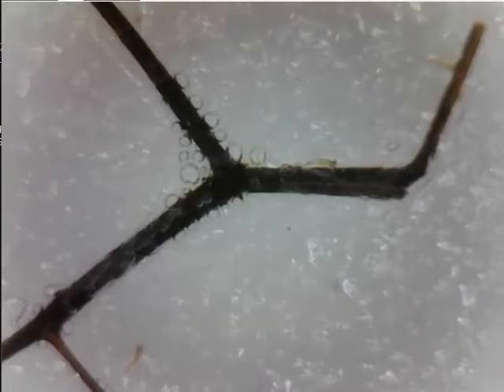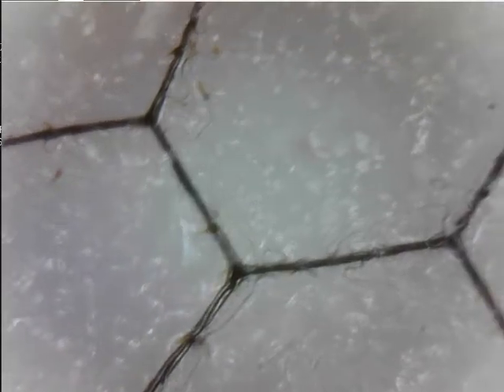Because, you, if you look, it seems, hey, it looks like a tree almost. Like a bunch of branches. It starts out with the trunk, and then it goes over here. Small offshoot. Keeps going small offshoot. Keeps going small offshoot. Keeps going small offshoot. Then, off to the small offshoot, another small offshoot, and there's another one. But, the main difference seems to be the offshoots attached, which makes sense, considering the wing. So, I guess my membrane would go around in here.